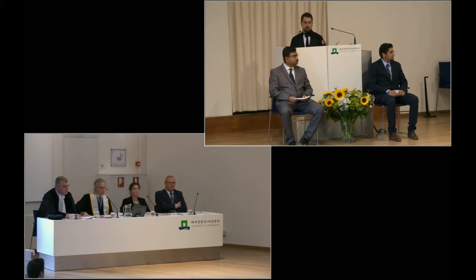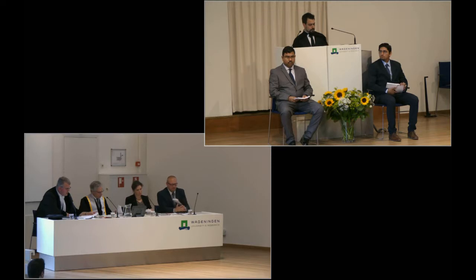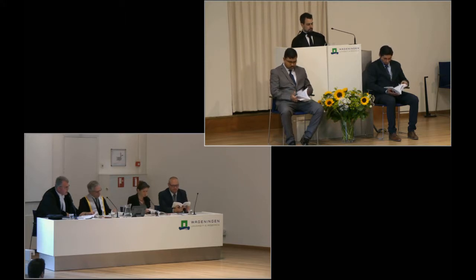Is there still time for a question, Mr. Rijo? Okay. Then I want to ask you a little bit more detailed question on Chapter 4, on Figure 4.1 and Figure 4.2. With these two figures, one is infrared and the other one is XPS. I guess you try to convince me that your method of oxidation and then the sodium borohydride method after that gives you one type of OH groups. That's at least what I guess Figure 4.2 in the XPS shows.